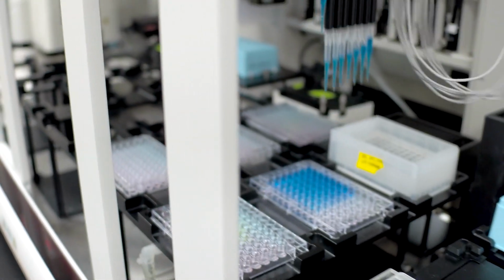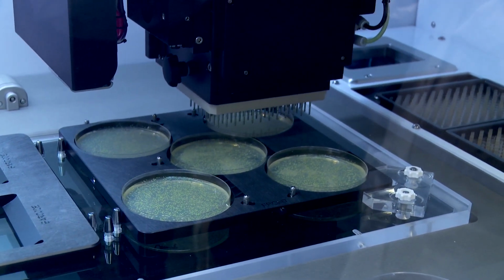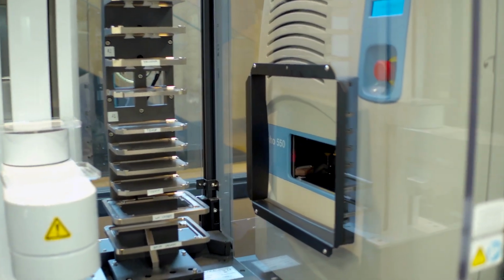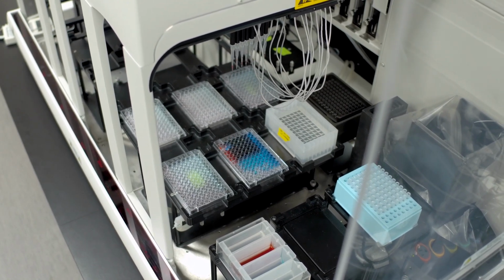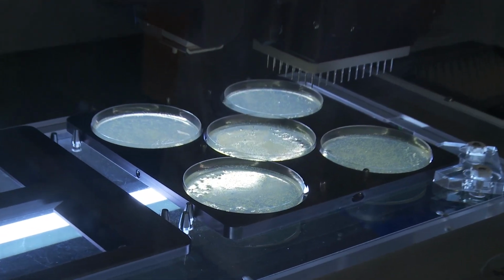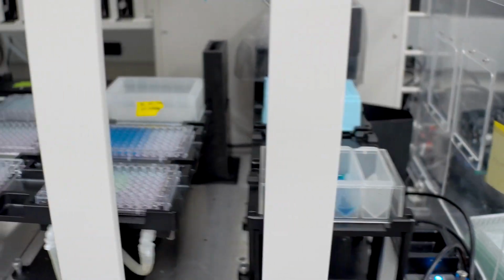A Genome Foundry does two things really that are important. The first one, it allows you to accelerate the pace at which you do research. So you can do thousands of things simultaneously on a robotic and automation platform. So that's pretty important. But even more important is your capacity to do higher throughput research allows you to ask much more complex questions that we were not able to either come close to addressing in the past, or even build, if we wanted to build these genetic systems in the lab, just because of the level of complexity. So now the Foundry, the robotics and the automation, allows us to do much more complex experiments.